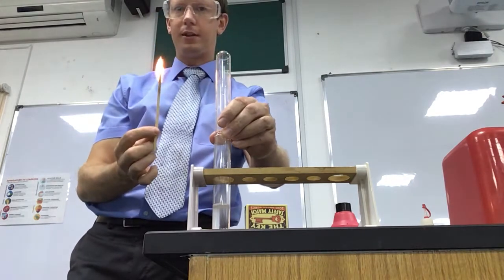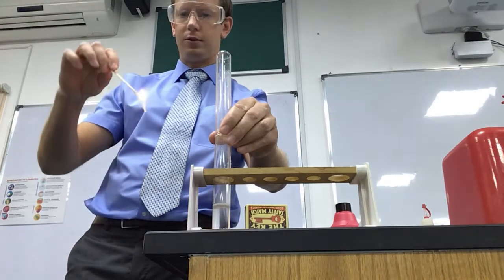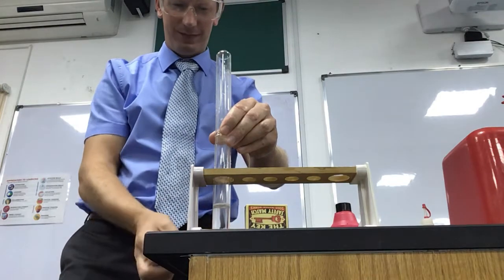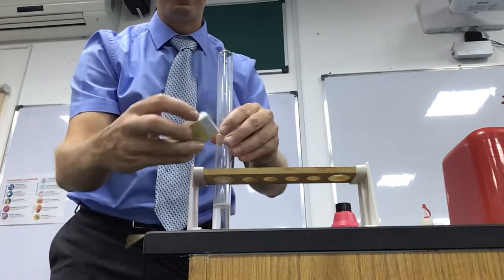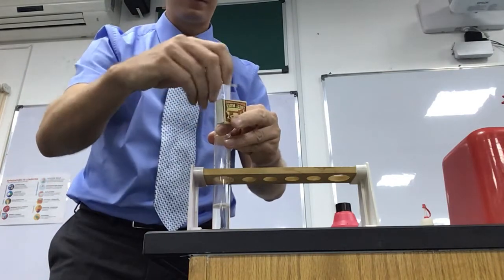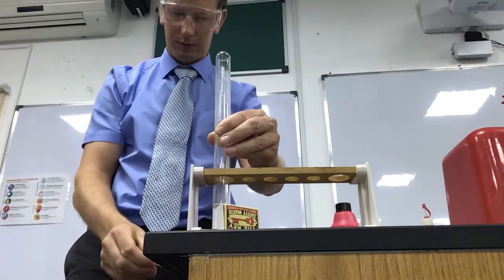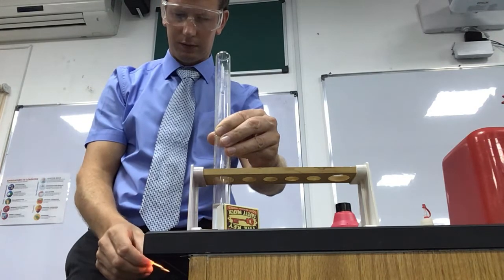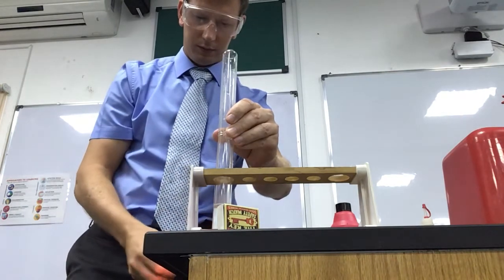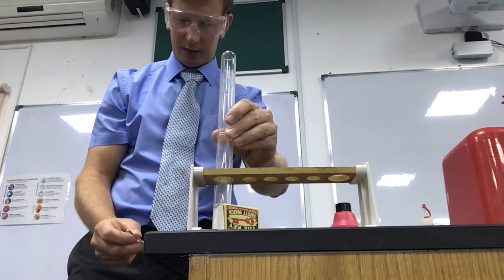If I hold the splint up like this it should get smaller. I don't want it to go out, so when it gets too small I'll tilt it up. It's still bubbling away, so I'm happy it's still working.